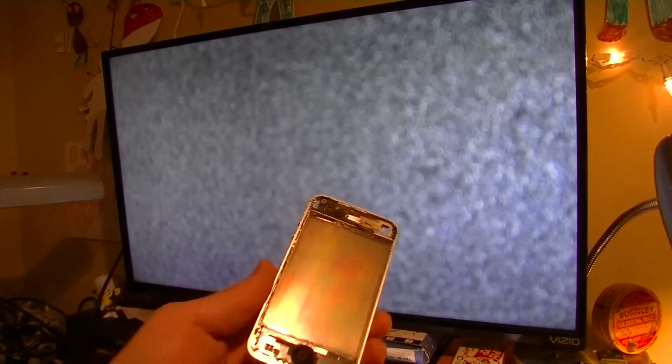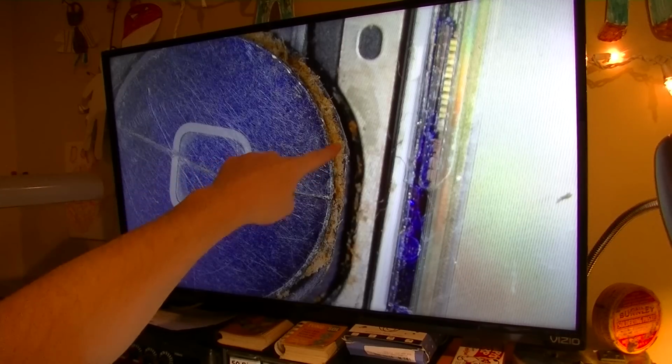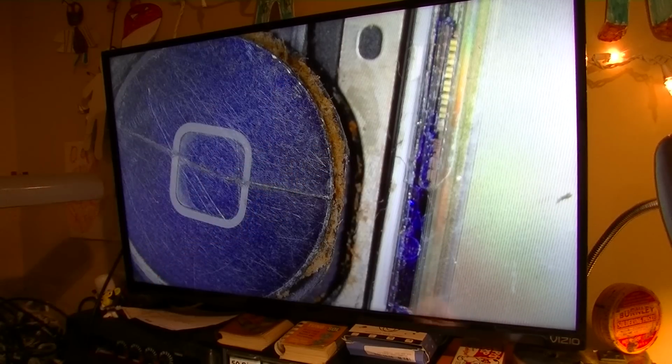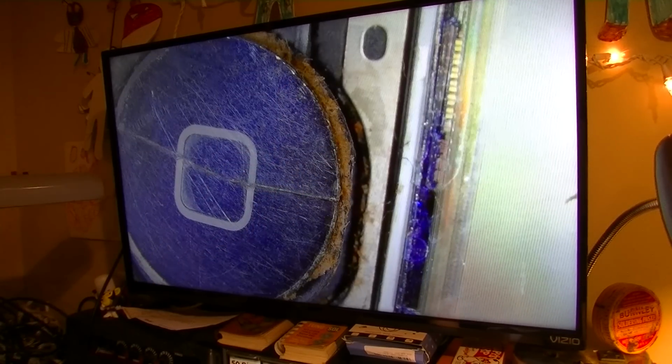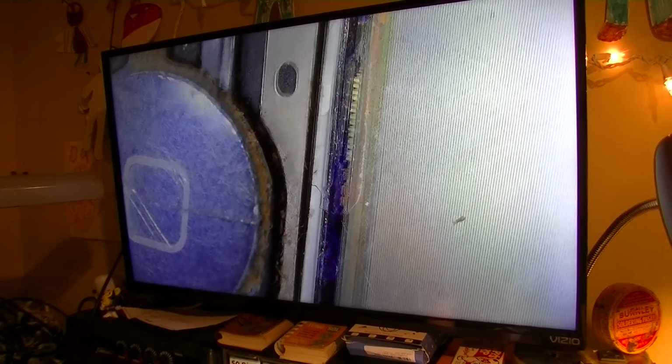Okay, you guys have got to check this out. This is my old iPhone. Look at all this crud around the button, and look at how many detailed scratches you can see. But this is really the most interesting thing to me. Look, this is the screen over here. Let's zoom all the way down. Okay, so that's lowered all the way down. Now let's focus it.